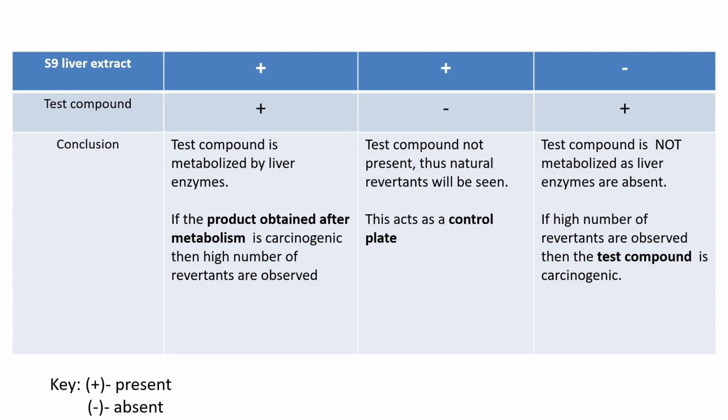Now, in the third example, you are not adding the liver extract, but you are adding the test compound. In this condition, the test compound cannot get metabolized as the liver extract enzymes are not there.